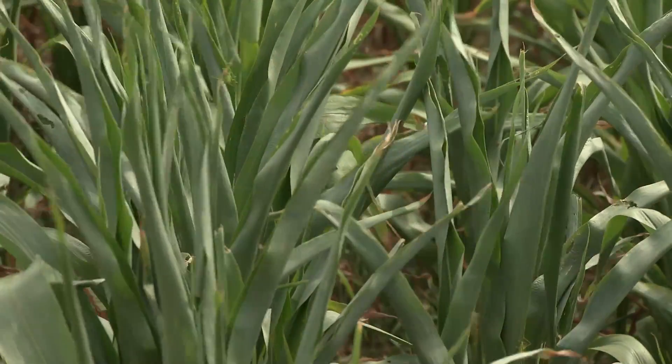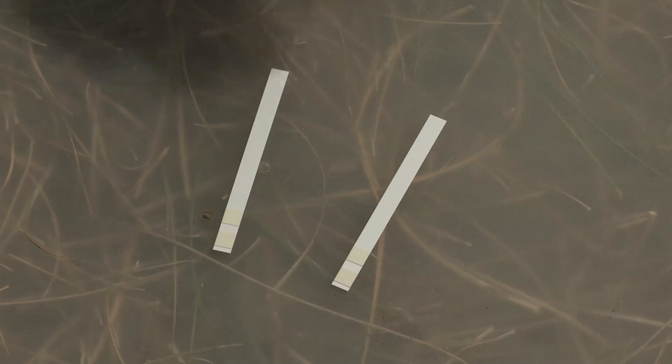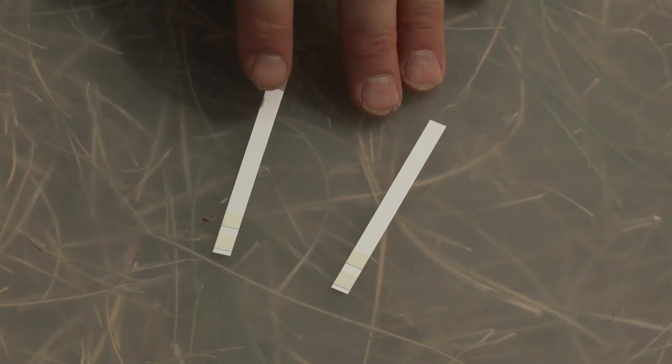Particularly during drought conditions or after frost, we've been sending out to county agents these little nitrate test strips. The county agent can go out to a farmer's field that's worried about the potential accumulation of nitrates and the potential for nitrate toxicity.